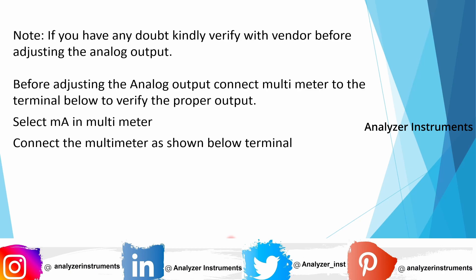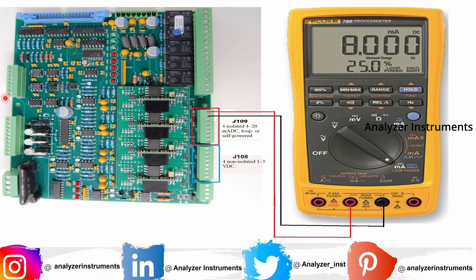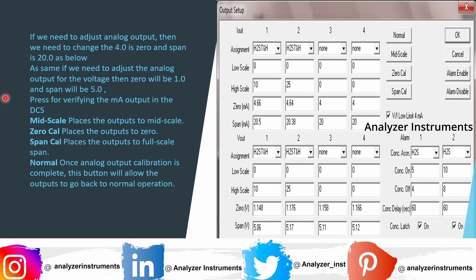Before adjusting the analog output, if you have any doubts, kindly verify with the vendor. Connect the multimeter to the terminals so we can observe the analog output values. Connect the multimeter as shown in the figure — the first two terminals on J109 are for H2S current output, and the first two terminals on J108 are for H2S voltage DC output. Do not interchange the positive and negative terminals. Connect the multimeter as shown for verification.